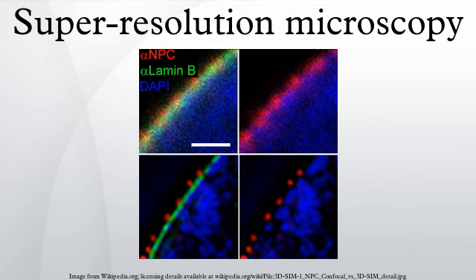Structured illumination microscopy. There is also the wide-field structured illumination approach to breaking the diffraction limit of light. SIM, or patterned illumination, relies on both specific microscopy protocols and extensive software analysis post-exposure. The main concept of SI is to illuminate a sample with patterned light and increase the resolution by measuring the fringes in the moiré pattern. Otherwise, unobservable sample information can be deduced from the fringes and computationally restored.